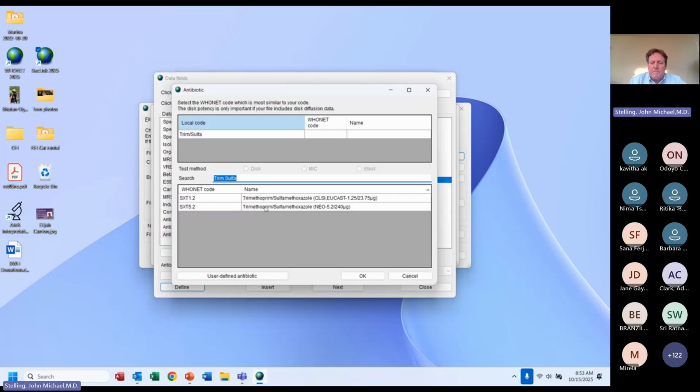BacLink is being helpful. It's the first one. Sometimes people tell me, John, WHONET is missing some drugs. And I say, no, it isn't. For anything official from CLSI or UCAST, it's in WHONET. And if you're doing some experimental stuff, that's different. But every official CLSI drug and UCAST drug are in WHONET.